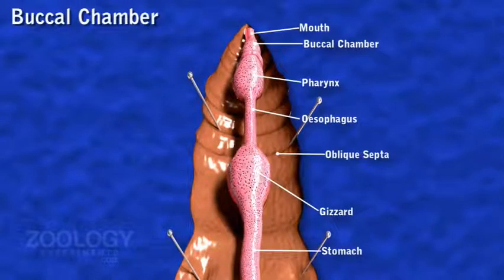Semicircular mouth situated ventral to prostomium at the anterior end of peristomium leads into a shortened, narrow, protrusible buccal chamber extending up to the middle of the third segment. Its lining epithelium is thrown into longitudinal folds.